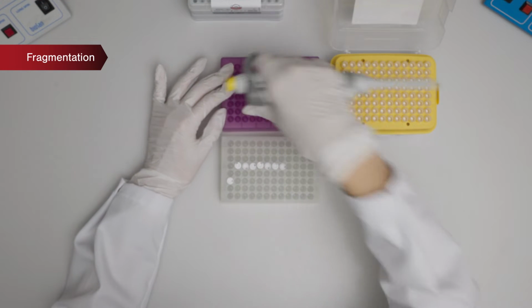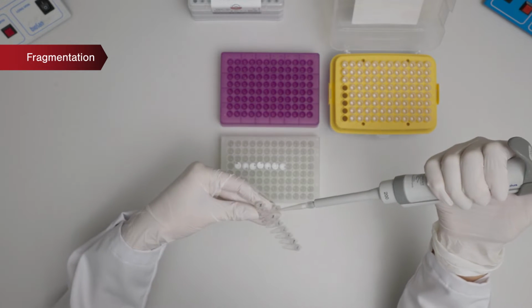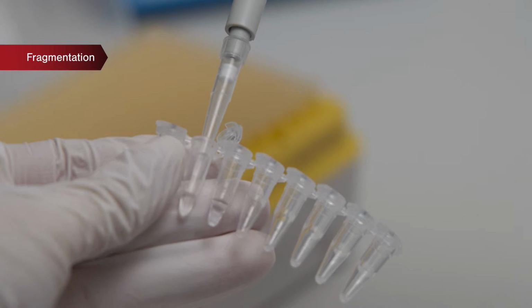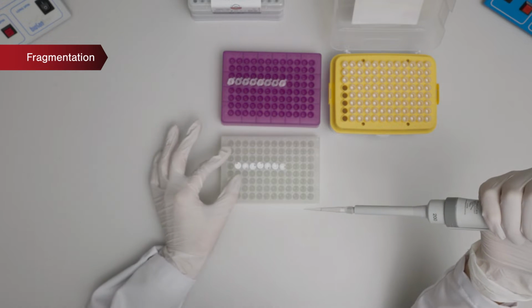300 nanograms in 55 microliters of sample are pipetted in Covaris microtubes, which are compatible with the S220 system and are meant for small sample volumes and fragmentation size.